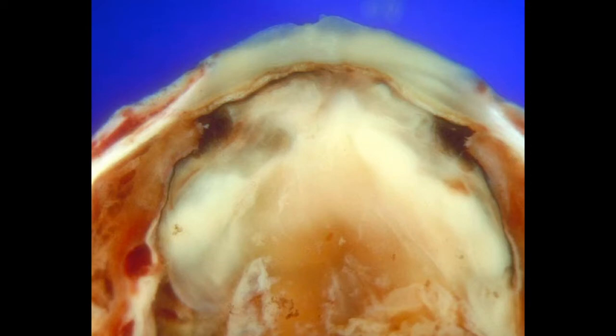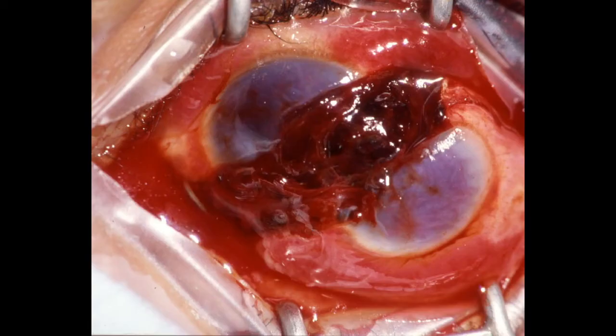This blind, painful eye developed endophthalmitis after a perforating injury. The anterior chamber is flat and a vitreous abscess is present. The retina was totally destroyed by the infection. This severely traumatized eye was a scleral shell filled with blood. Perforating injuries of the globe frequently result in loss of intraocular contents.